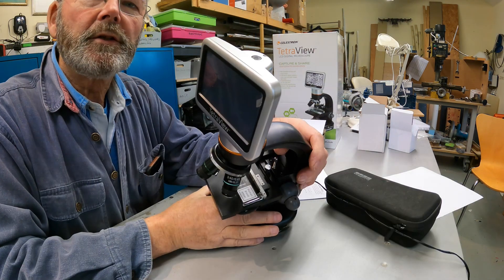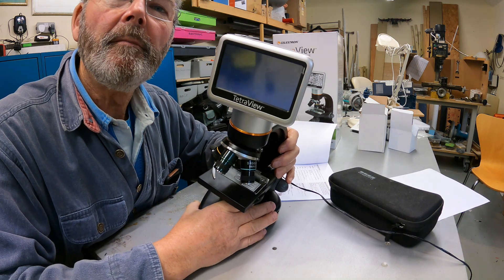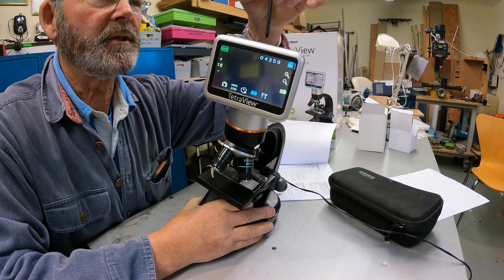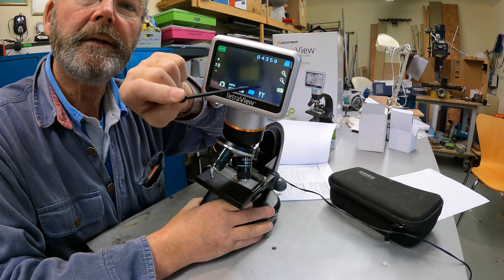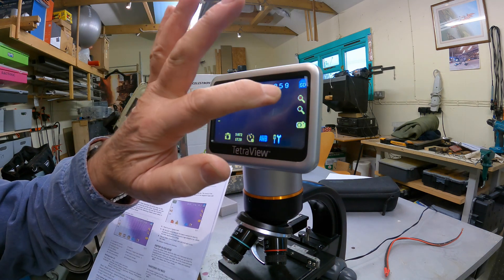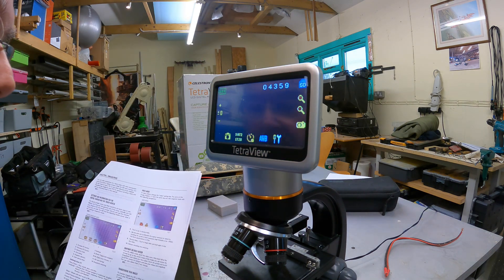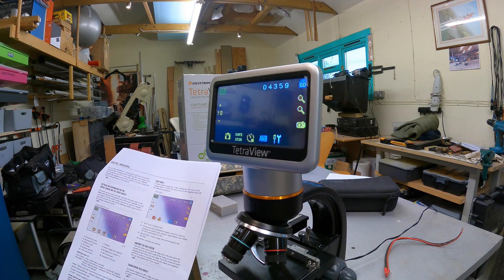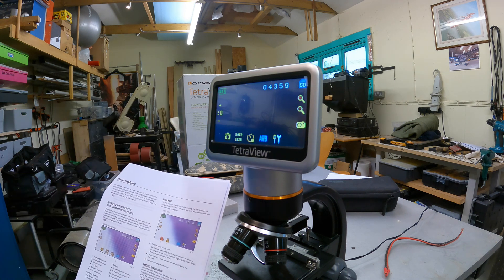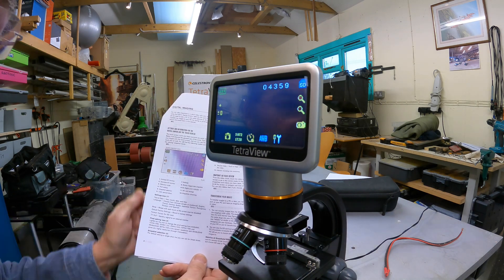To turn the LCD viewer on, there's a power button at the top - just press it once. On the back of the LCD screen there's a novel little stylus pencil that pulls out, which you can use for the touch screen. The LCD is a touch screen with various tools available: you can zoom onto the image two, three, or four times. Whatever the magnification you're looking at, you can increase it again by up to four times. You can take videos using the onboard SD card, take photographs, and it shows you the power status. The manual has a comprehensive page that walks you through all the LCD screen functions.